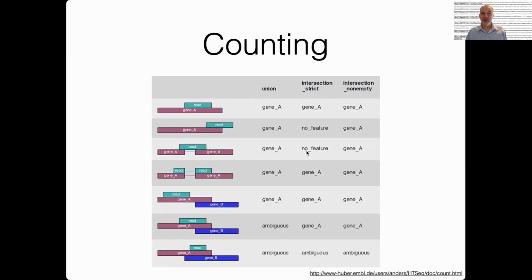Where the read is spanning and includes the intron. It's not exactly what you'd expect for normal splicing, but you see that sometimes. There are cases of overlapping genes. In this case, you can unambiguously say that read goes with gene A, but how do you assign this read? Does it go with gene A or gene B or either? And then how do you assign this read where it's totally in the overlap?